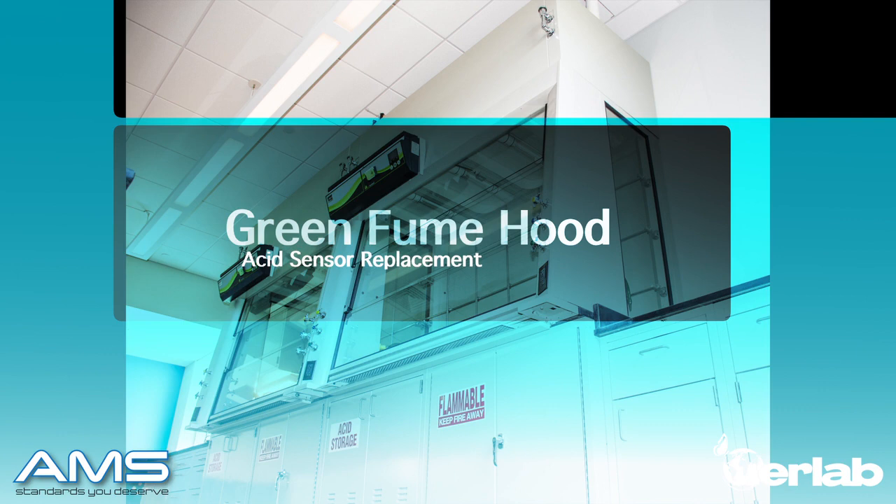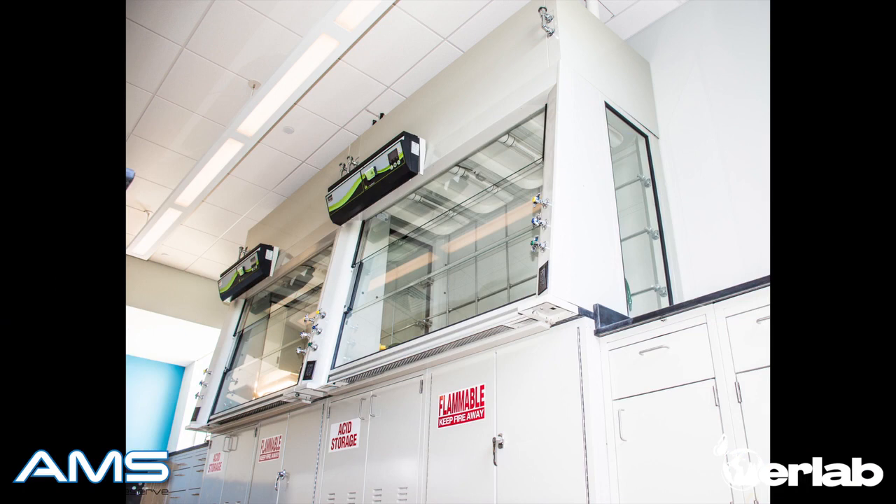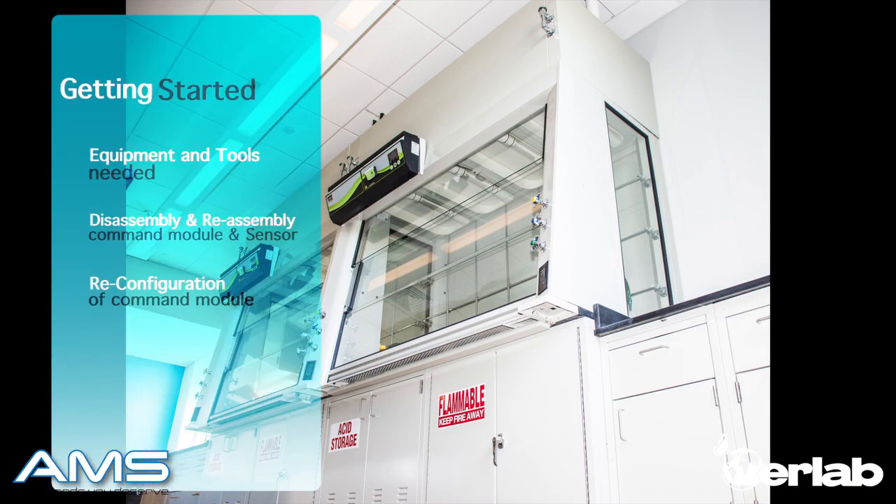Welcome to the green fume hood acid sensor replacement video. This video will cover everything you need to know to install a new acid sensor in your green fume hood.